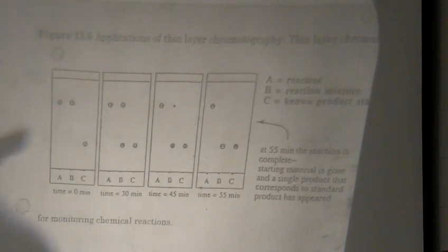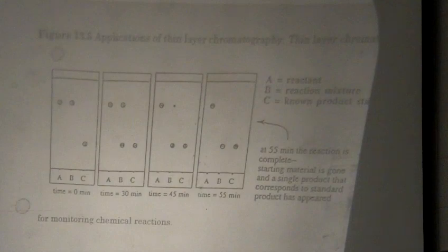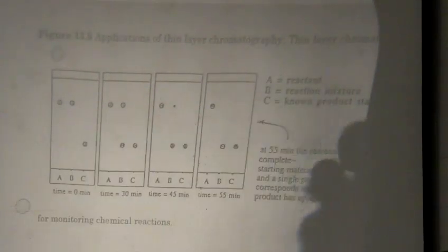We're going to be looking at the same thing with your reaction, but your reaction is so fast that as soon as we add the cyclopentadiene, we're going to tell you to have your TLC plate ready, have your spotters ready. You're going to spot that reaction because it goes so quickly. If you don't spot it immediately, it will be over before you can actually catch it, okay? But we're going to look for this similar type of progression, okay?